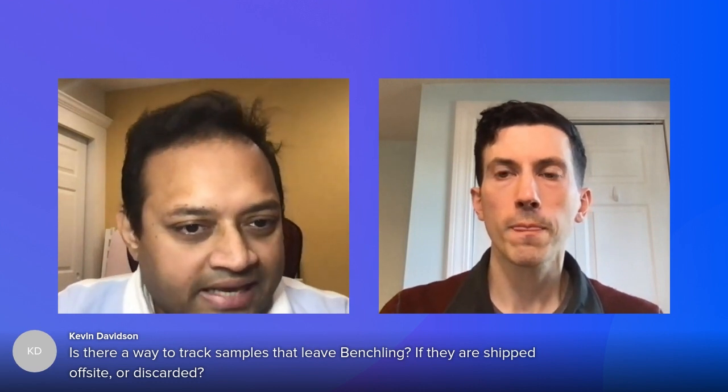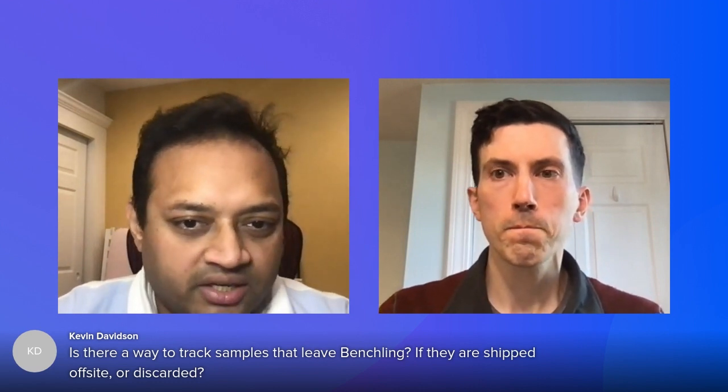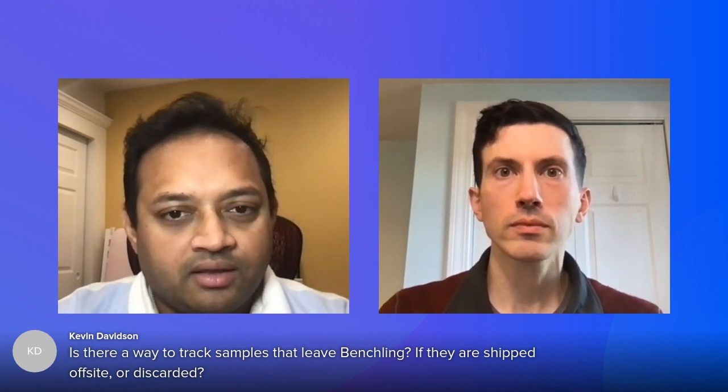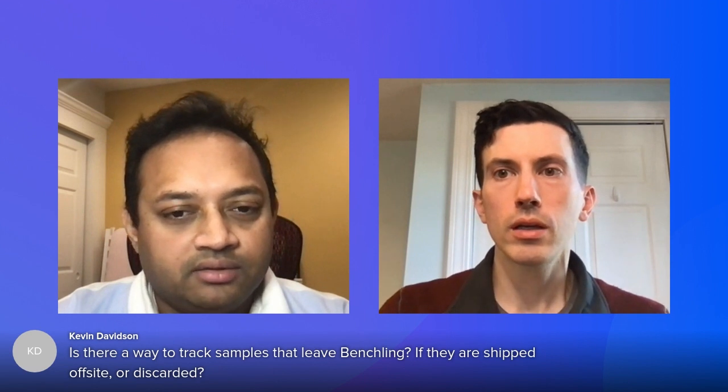So next question from Kevin: is there a way to track samples that leave Benchling if they are shipped offsite or discarded? Tom, you want to take that?